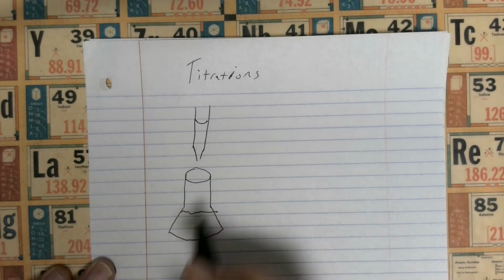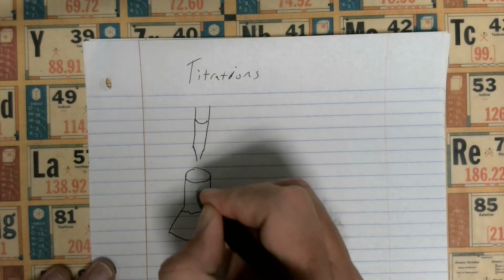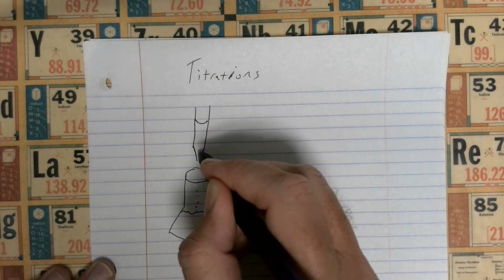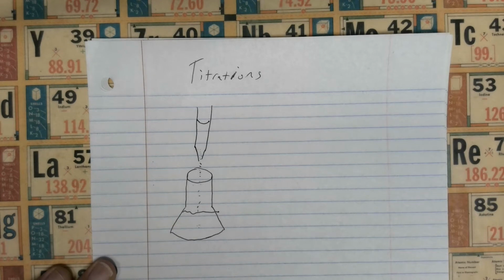And then you also have the other one, the opposite one, in here, and then you drip the acid or the base in there, and at some point you will put an indicator in here that will change color when you've reached the end point, which is hopefully also close to your equivalence point.